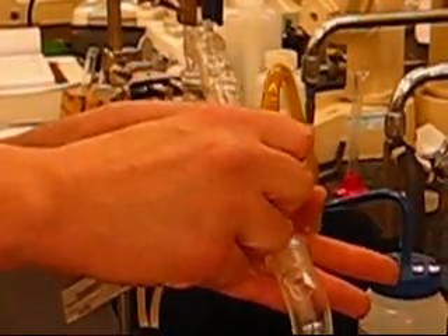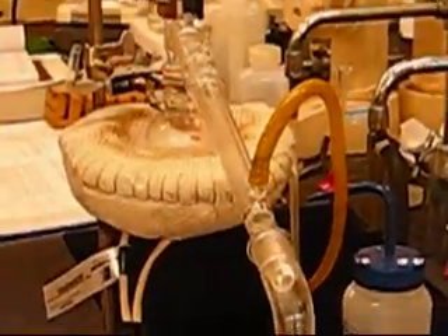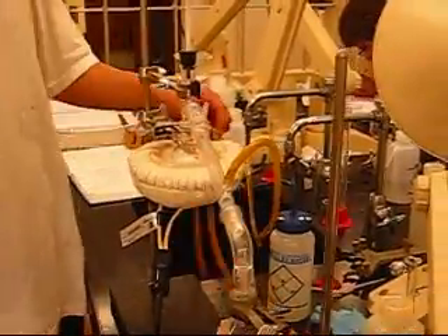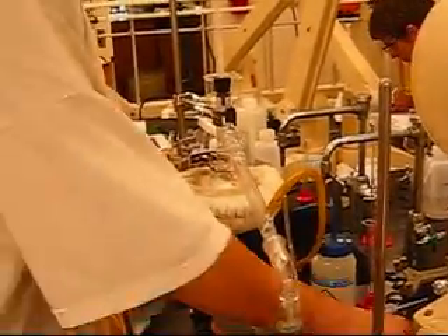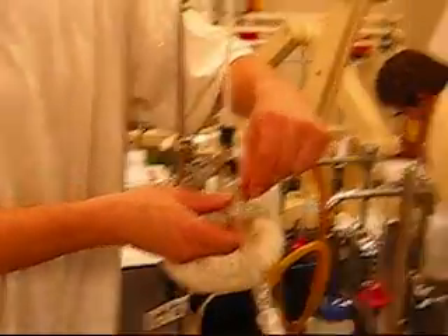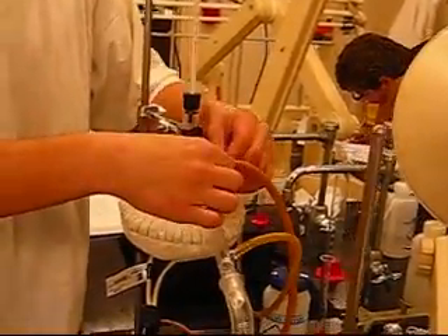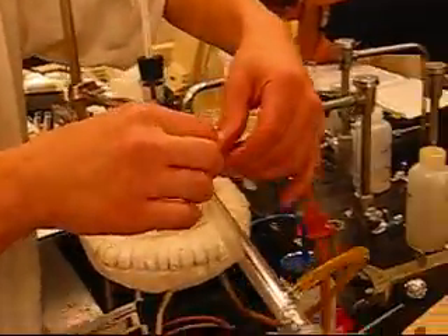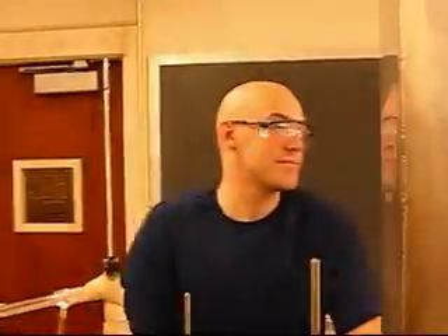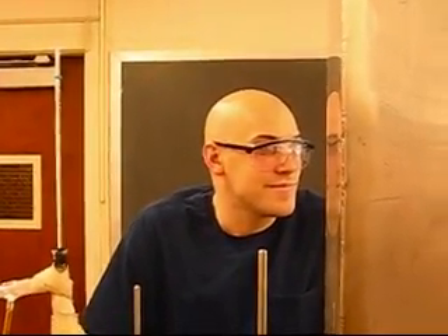The last thing we want to have happen is to have one of these hoses just come right off, because you're going to have water shooting straight at the sink. So what we do is we put this one on. It's good to use wire on both of these — just take some regular copper wire like this and wrap it around so that it's pretty tight. You don't want this thing getting away on you.